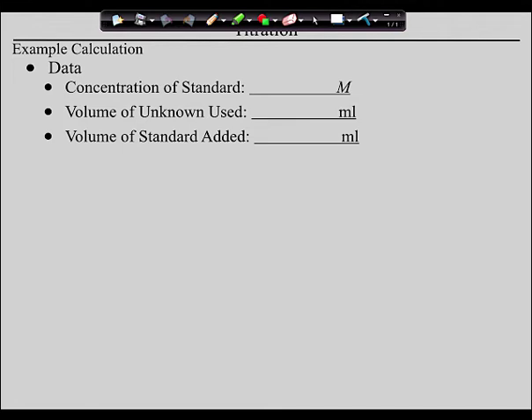Okay. So guys, here's the deal. What you're going to do now is you are going to learn to titrate. And guys, this is a very real thing. And I'm going to show you how this works. When you come back for AP next year, you will actually do 7 titration labs, all in a row. It takes us about 7 weeks to do all of them. Guys, today and in this year, you are not going to get to use any of this. But I want to show you how this works so that you understand what you will be doing through virtualization.